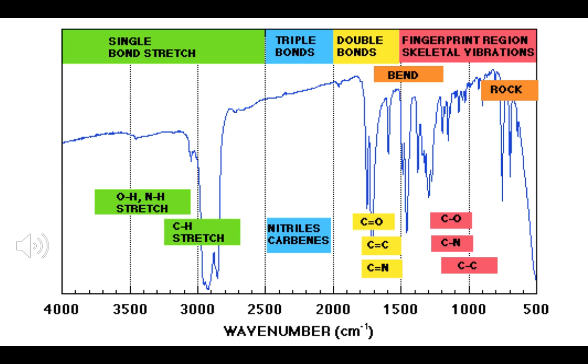The carbonyl is usually very strong and sharp. That's the carbonyl peak. So if you look at this picture, I would say the sharp peak over here is the carbonyl, and then this peak towards the right of it would be the carbon peak.